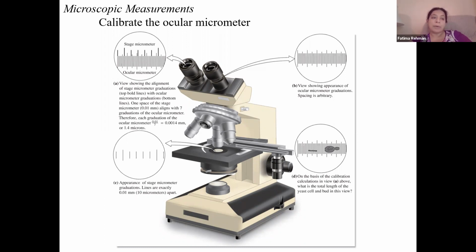Yes, you can adjust the amount of light. Okay, so now let's think about ways that we can adjust the amount of light. And on that note, actually, would you want your light to be higher or brighter, or would you want it to be lower in order to enhance contrast? If you do it higher, what you will find is that sometimes you don't even see your cells.